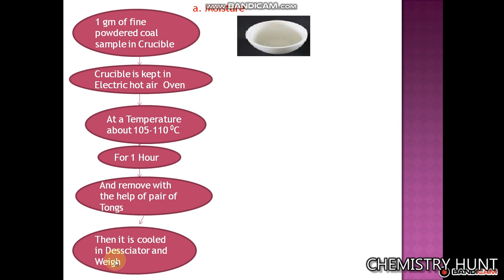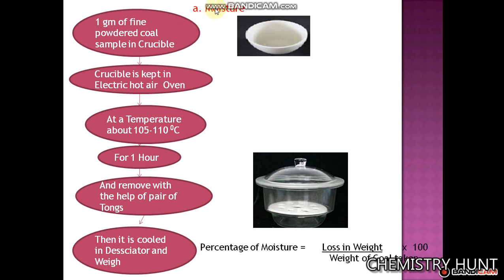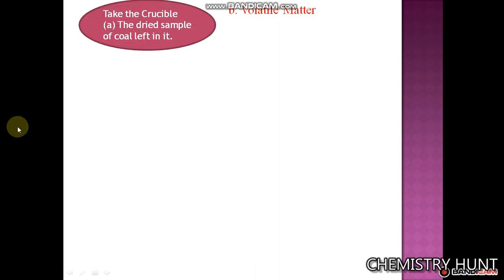The crucible is then cooled in a desiccator. Here we can see the desiccator where we keep the crucible to cool it. After cooling, we take the weight of it. The percentage of moisture is calculated as: loss in weight divided by weight of the coal sample, multiplied by 100. By this method we calculate the percentage of moisture.